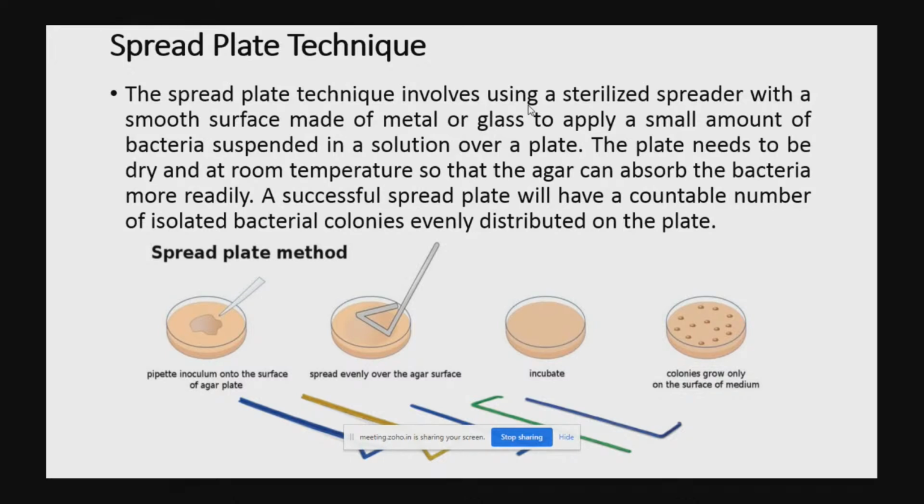What is the difference between past and future microbiology laboratories? In the past, there was a lack of inventions. We were using glass spreaders and glass Petri plates. We needed to autoclave them. We needed to prepare the media in house. Everything took a longer and longer period of time.